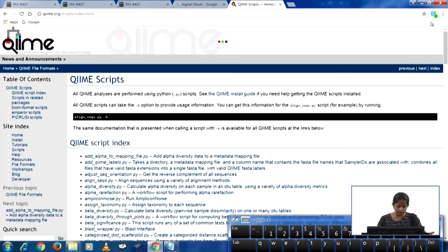One difference that I have noted between QIIME and Mothur is that while Mothur is computationally kinder than QIIME, QIIME tends to make prettier plots, because data visualization is so important. The other thing is that certain funding agencies in the US now require people to submit their data to QIIME and to use QIIME. So in that case, QIIME does have an upper hand, but Mothur offers a lot of flexibility. If you know coding, if you're a hardcore bioinformatician, I see that there are advantages and disadvantages for both Mothur and QIIME. Both are equally good and both are equally useful.